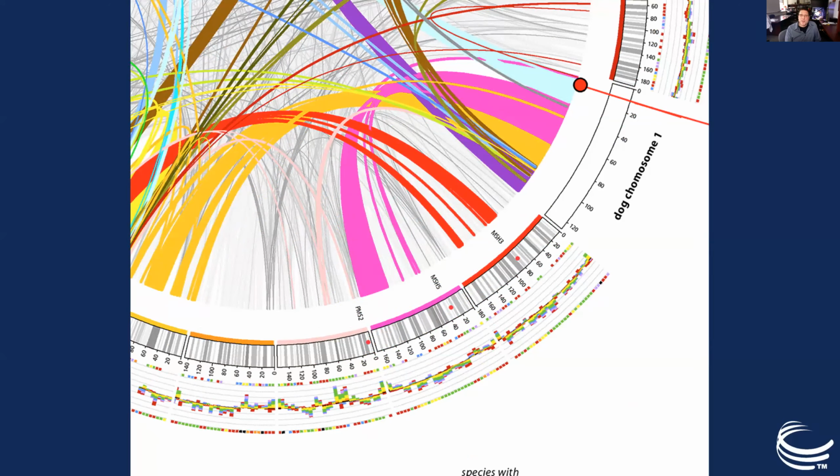So some of the things you get besides just the chromosomes that we just saw. So there's the chromosomes. You can also add data tracks. You can also add what are called links. And the links allow you to show relationships. For example, here we can very clearly see the middle of dog chromosome 1 is actually highly related, meaning that the neighborhood of all the genes that are encoded on it are very similar to human chromosome 5, and over here in the yellow is 9.